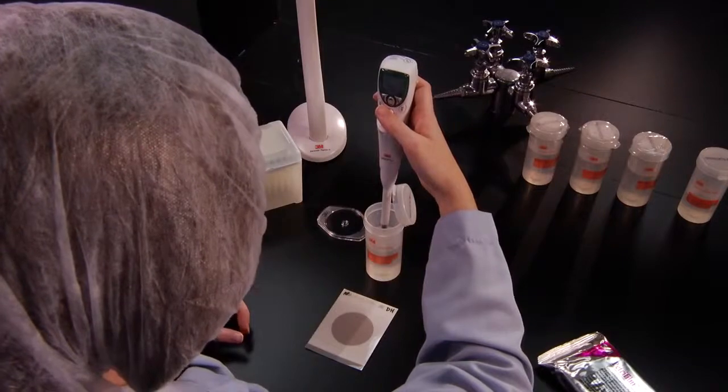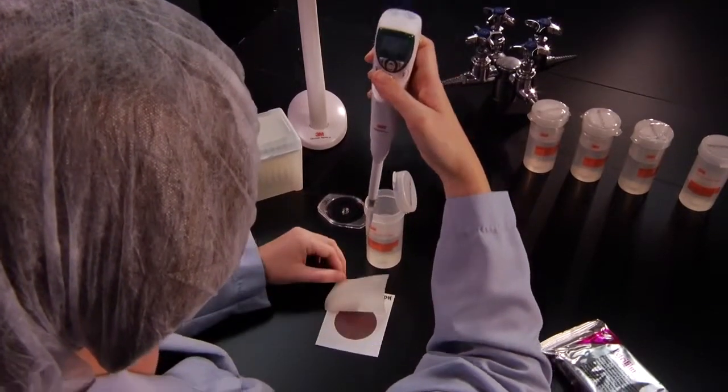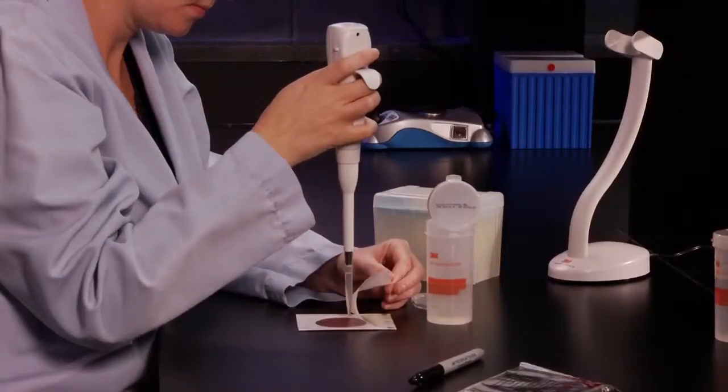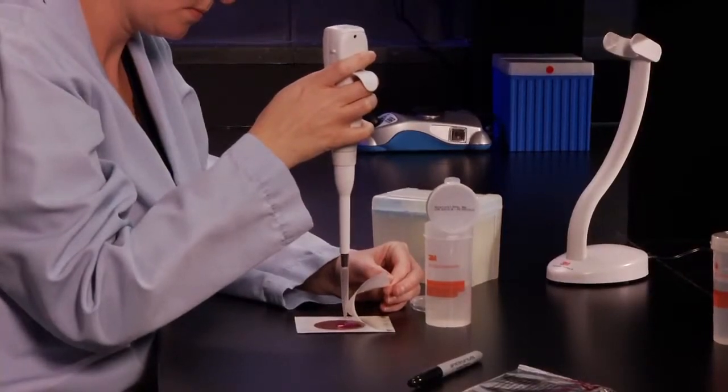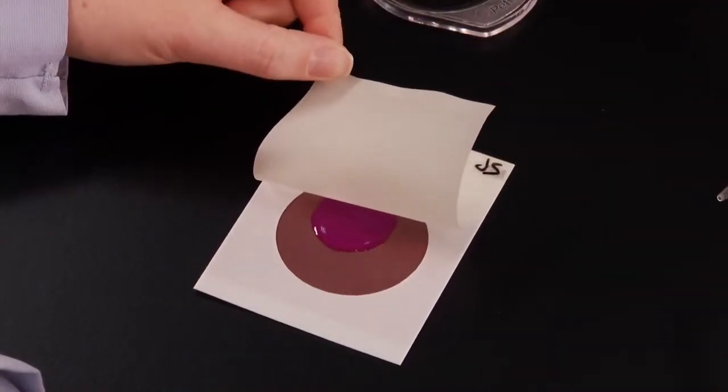Draw 1 milliliter of sample into the pipetter. Lift the top film and hold the pipetter perpendicular to the 3M PetriFilm plate. Pipet the sample onto the center of the bottom film.